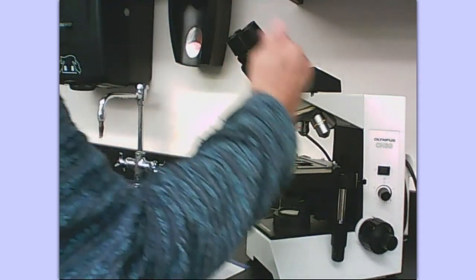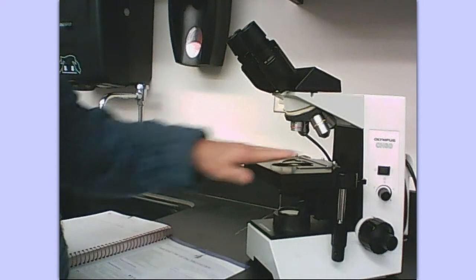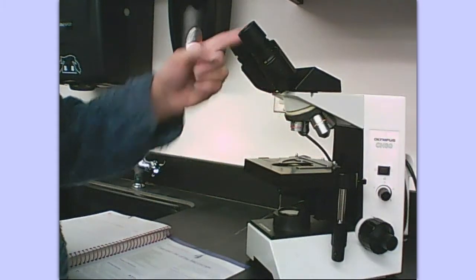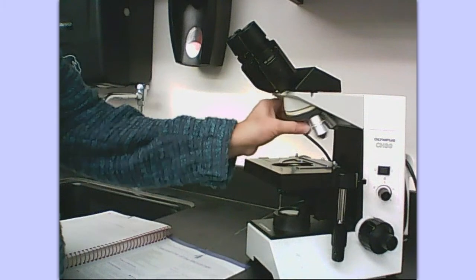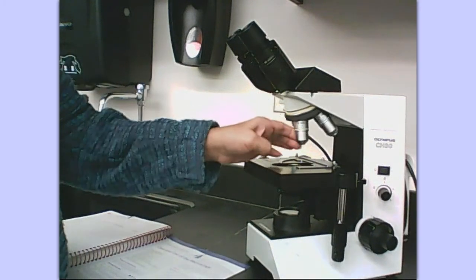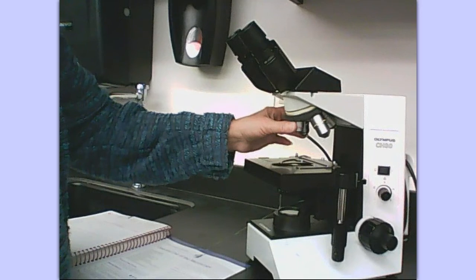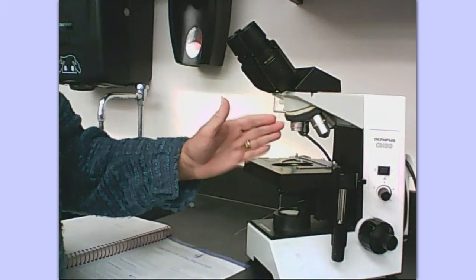This is the body tube and the image passes from the stage — what you're looking at — through the objective, through the body tube, to the eyepiece. This is called the revolving nosepiece. When you are using the revolving nosepiece, make sure it is clicked and locked into place.